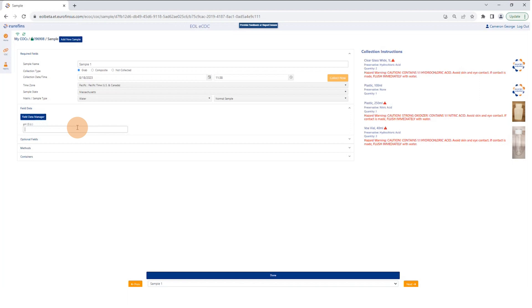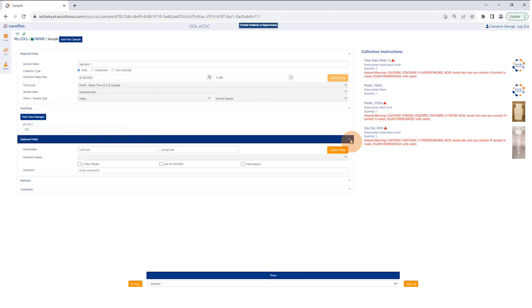If you want to collect field data, down here under field data you can add your pH reading. If you want to add additional field data parameters, you can go to field data manager and add them. We also have some optional fields here, and you'll notice all these fields are collapsible — that's to give you more space on your mobile device.